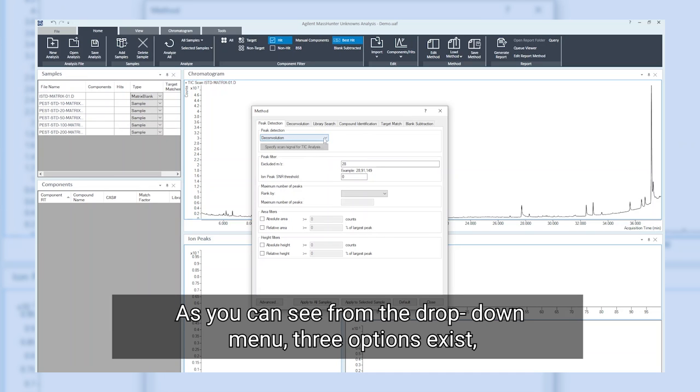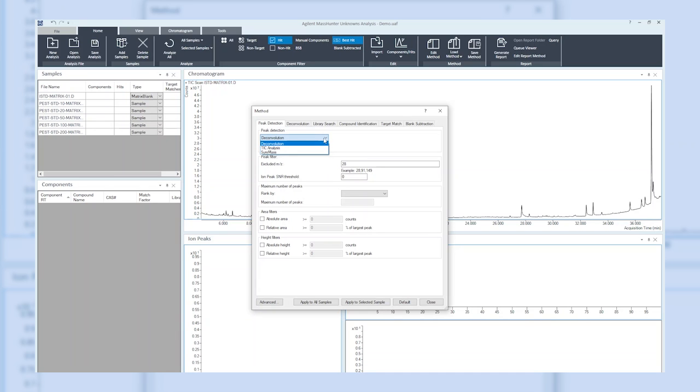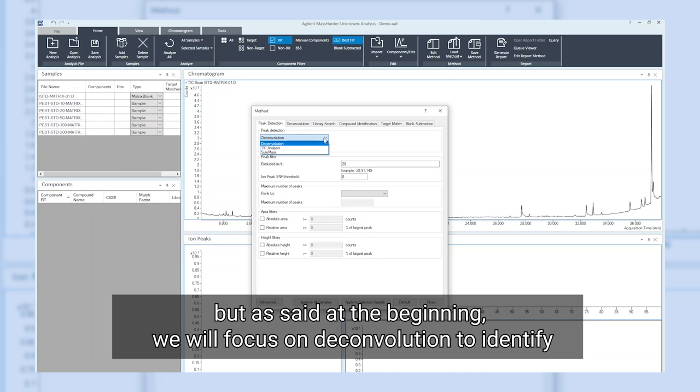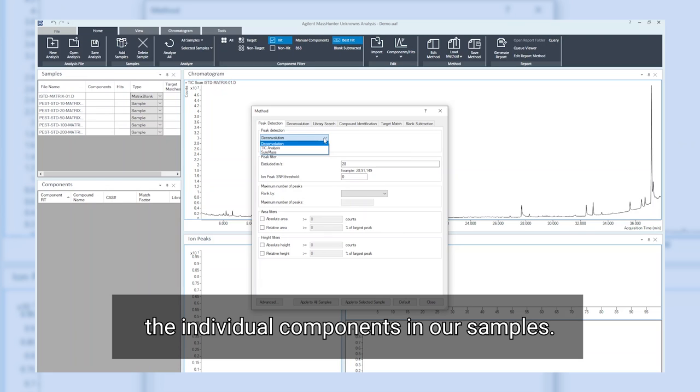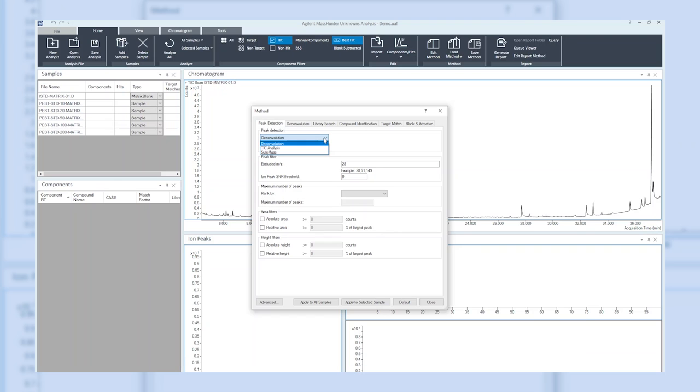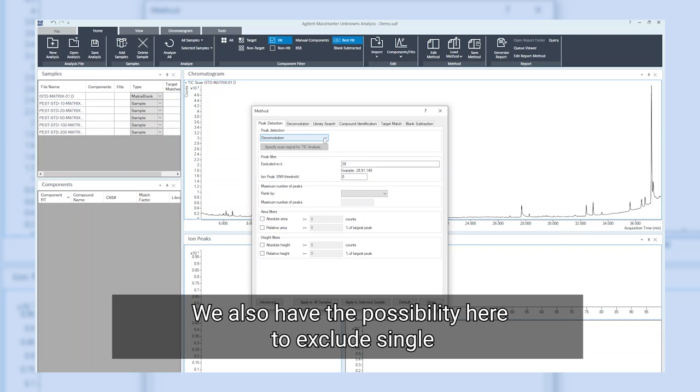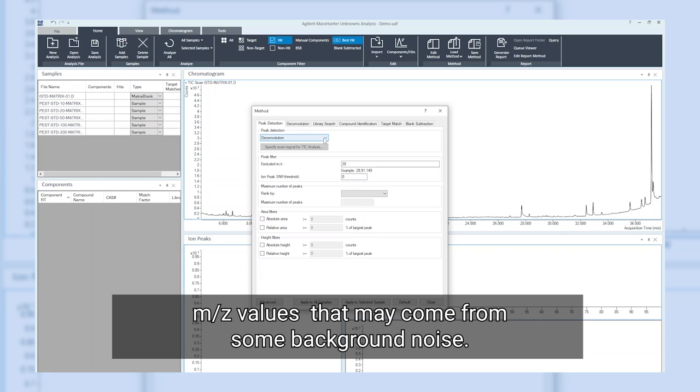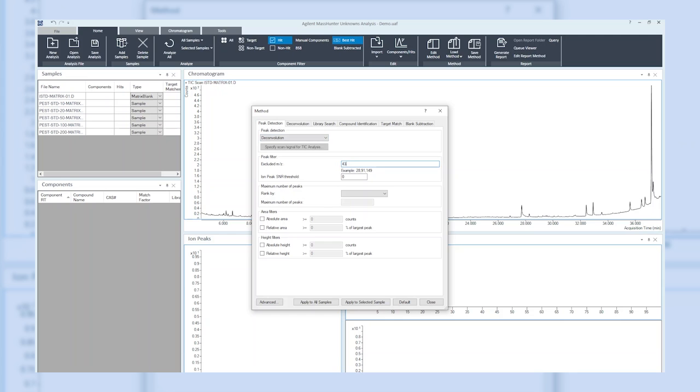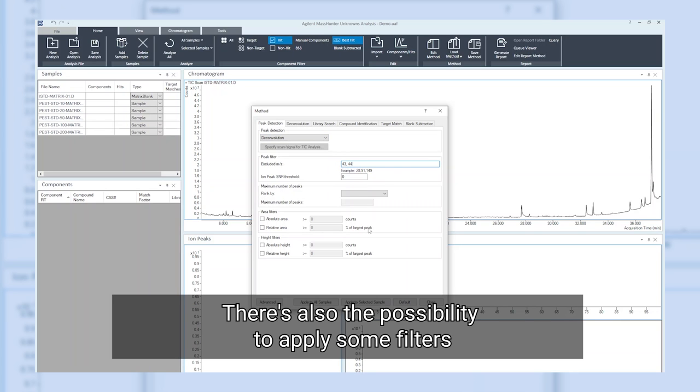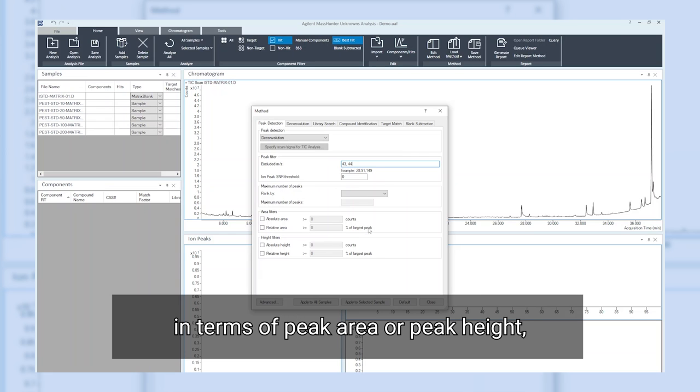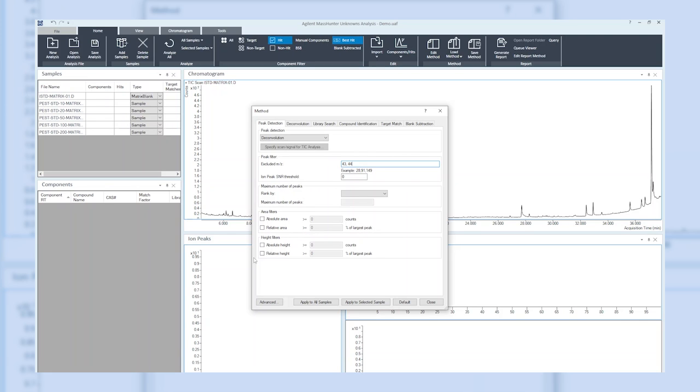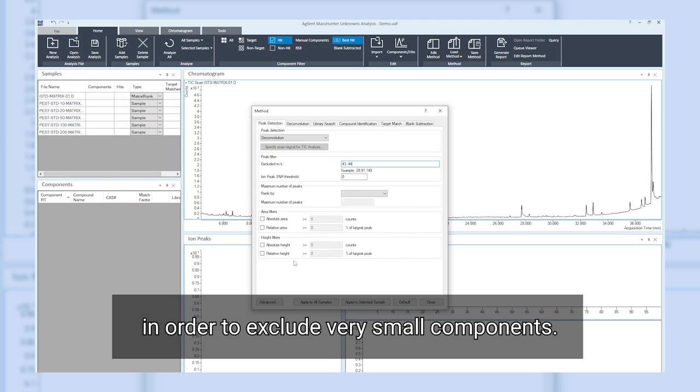The first tab is about the peak detection method. As you can see from the drop-down menu, three options exist, but as said at the beginning, we will focus on deconvolution to identify the individual components in our samples. We also have the possibility here to exclude single m over z values that may come from background noise. There's also the possibility to apply some filters in terms of peak area or peak height in order to exclude very small components.